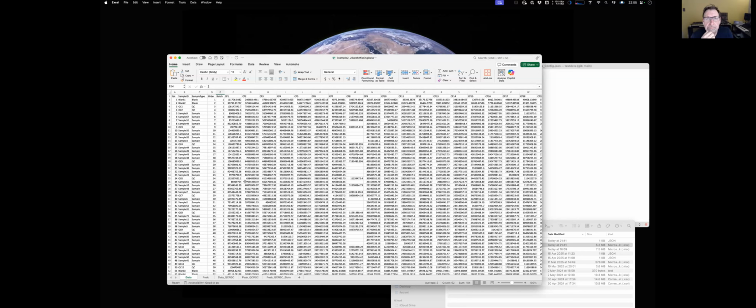And maybe, David, if we still have 5 minutes, I would also have 1 or 2 questions that we can maybe discuss. So I think also regarding this question, there is also a practical limit, right? We are, for example, now running 1,000 samples, and it's just not practical that we defrost everything and do a pooled QC of 1,000 samples. It's just not too feasible. So what we opted for in this case is that the first 2 plates that we are going to run, we do a pool from the first 2 plates, and we use that as a QC for the whole study. So I don't know if that would be a good solution from your perspective.